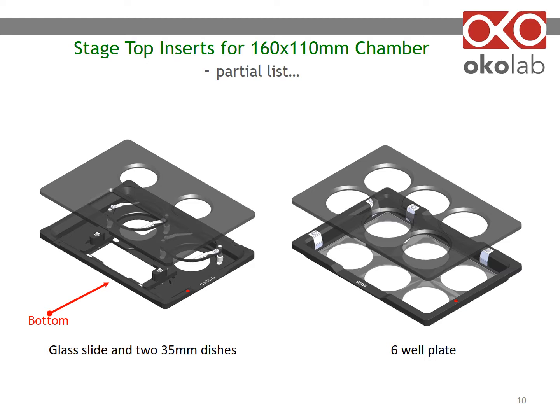Each insert has two parts: a bottom to be placed inside the chamber containing the sample, and a corresponding plate that rests on top of the chamber lid. It prevents condensation from forming so that the sample can be imaged in transmitted light as well. Here is an example for a six-well plate insert.